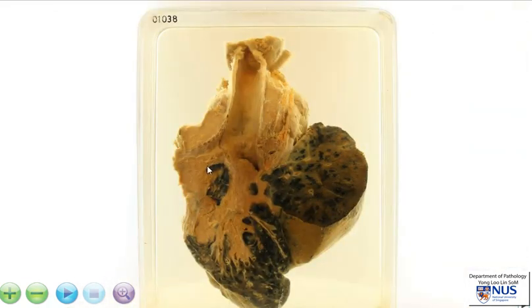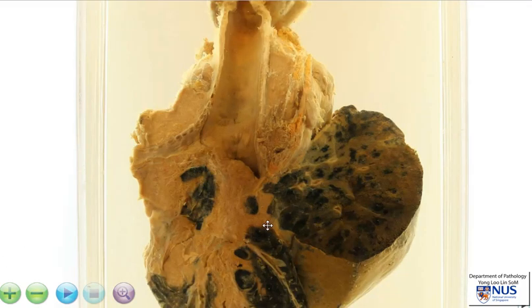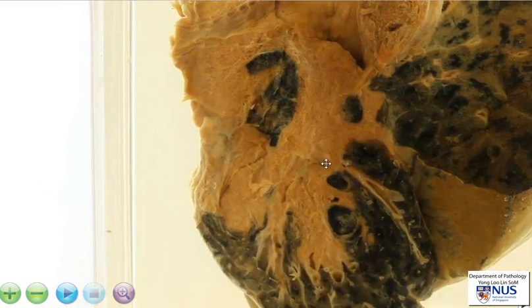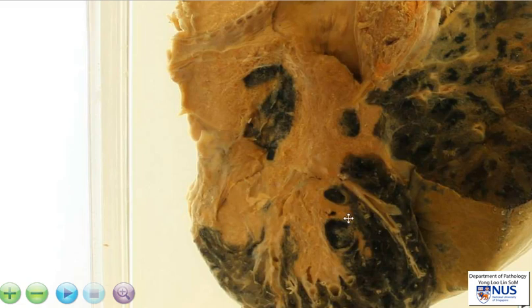The main pathology is here. We can see a hilar tumour that is very irregular and is clearly infiltrating into the lung parenchyma. The cut surface of this tumour appears tan, it is quite fleshy, it is fairly homogeneous, and clearly it is sending these irregular extensions into the lung parenchyma.